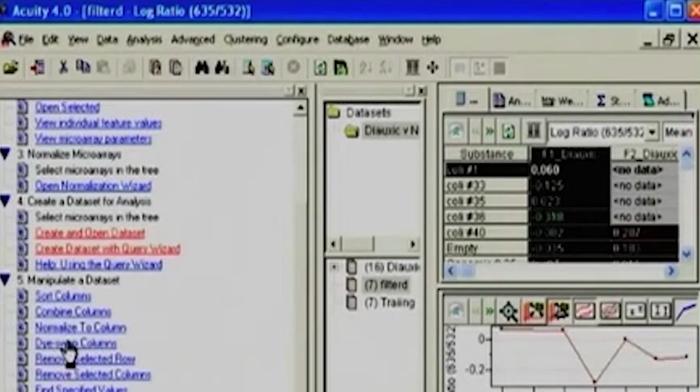So many times you can also go for a normalized to column. The meaning is I am having a 0 to maximum. So I want all my data to get normalized to first column. This feature is used when you are essentially using a time point. So all will be standardized or normalized to one column which you have defined as a 0th one.